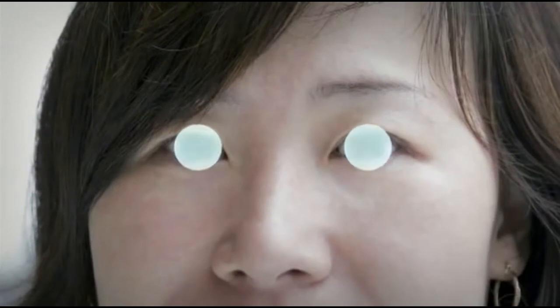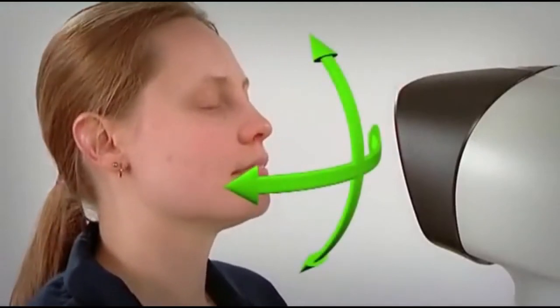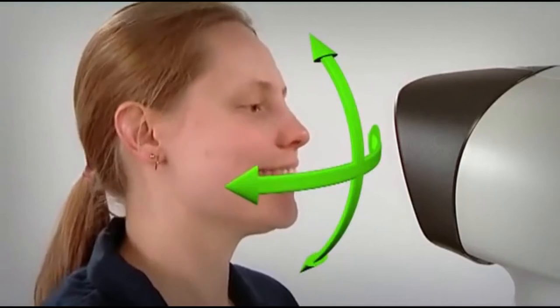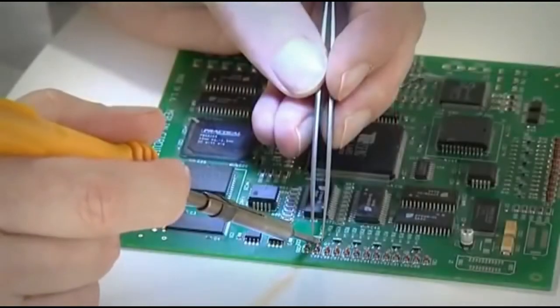Because Mantis expands the exit pupil from the diameter of a traditional microscope of 3mm to 30mm, a user can move her head and body both backwards and forwards and side to side to achieve a comfortable working position.